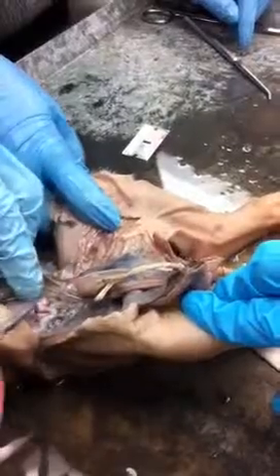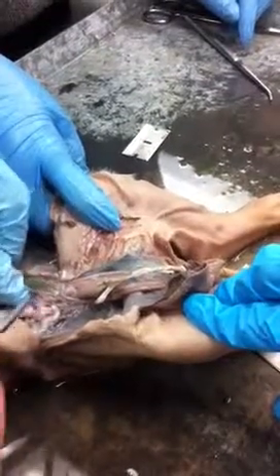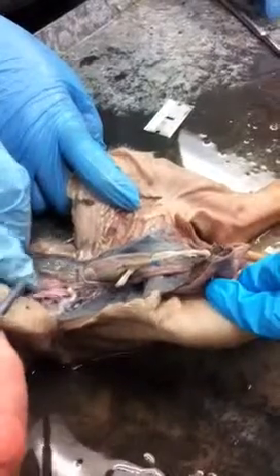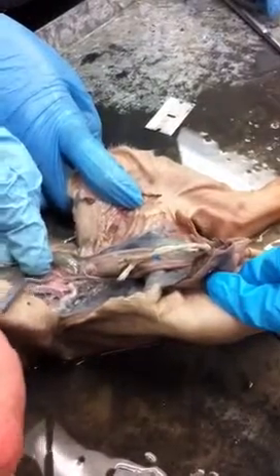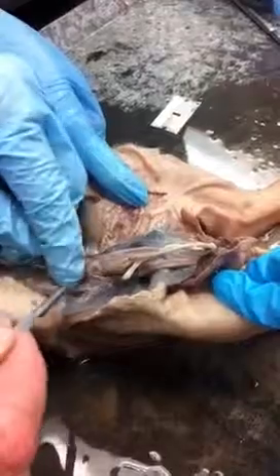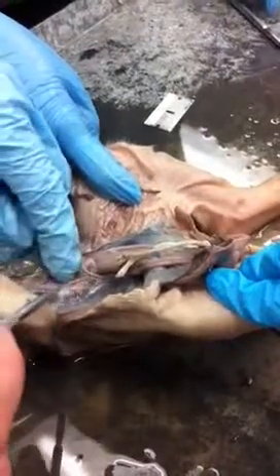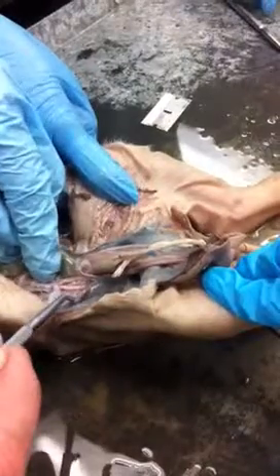It's a branch, and I think it's down there. Yeah, so you can see the problem is that the arteries are sitting on top of it, I think. Here's one branch here, here's the other branch for the common iliac. But then we lose our injection, and they don't have any blue latex to find it. But the way it's supposed to go is, can I draw a map right here? Go right ahead.